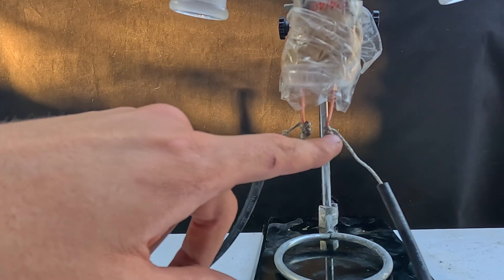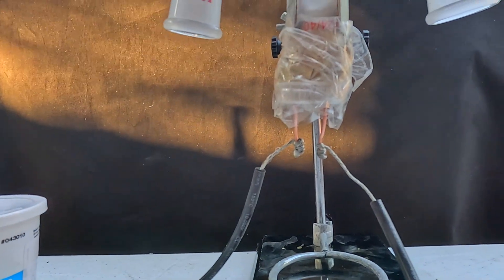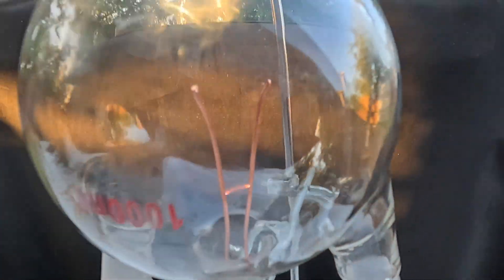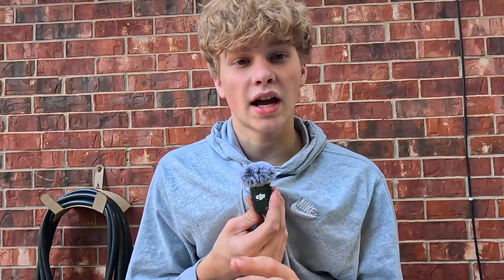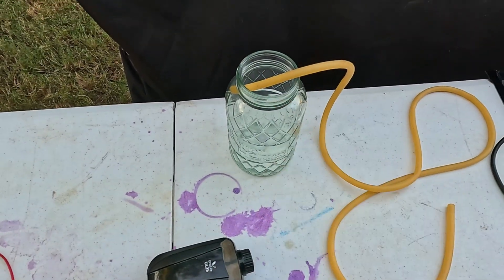If I turn this on, it would most likely arc at the wrong point, so let's put something in between it so it arcs where we need it to, up top. What we've created is a Jacob's Ladder, and there's some controversy as to whether or not this is the best solution. What I do know is that it's not great for our transformer to keep short-circuiting like that, so for the longevity of our system, it's better to not have a Jacob's Ladder.